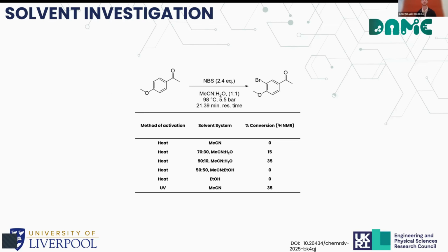As such, we then conducted a solvent investigation, and seeing as the water was deemed the problem in this scenario, the obvious first attempt to alter the solvent system would be to conduct it in neat acetonitrile. However, this returned 0% conversion.